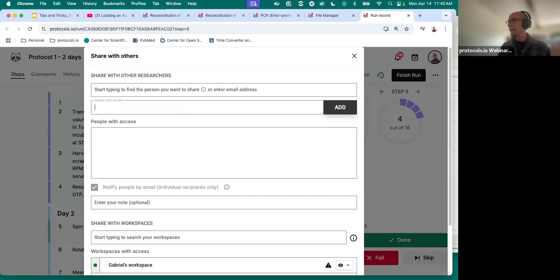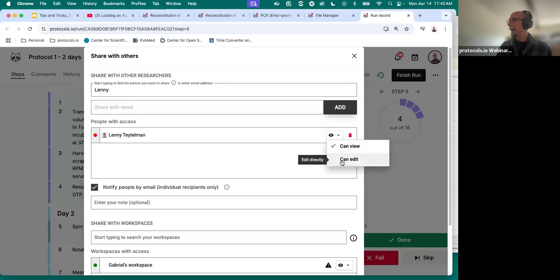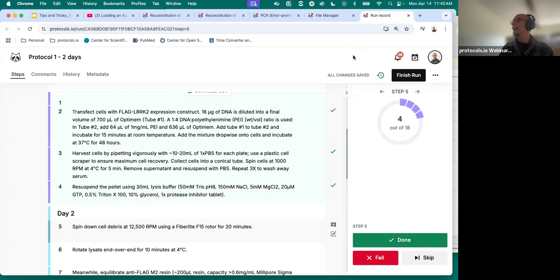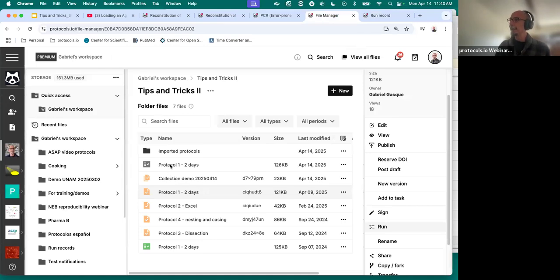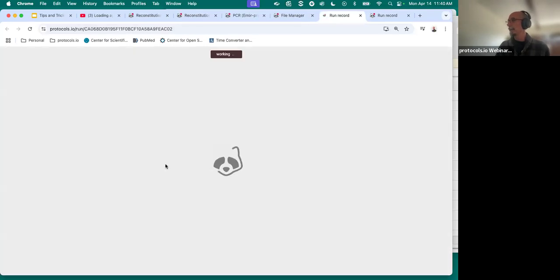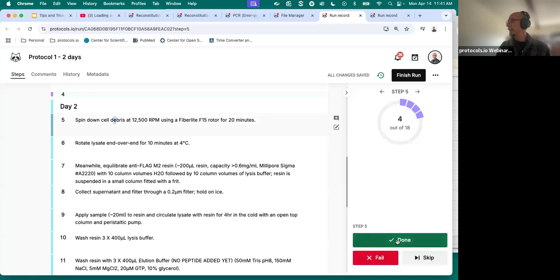Let's say Lenny again. I enable Lenny editing. I save. And now Lenny can come tomorrow and finalize the protocol. So if I were Lenny, I will reopen this incomplete run. I will move to day 2.